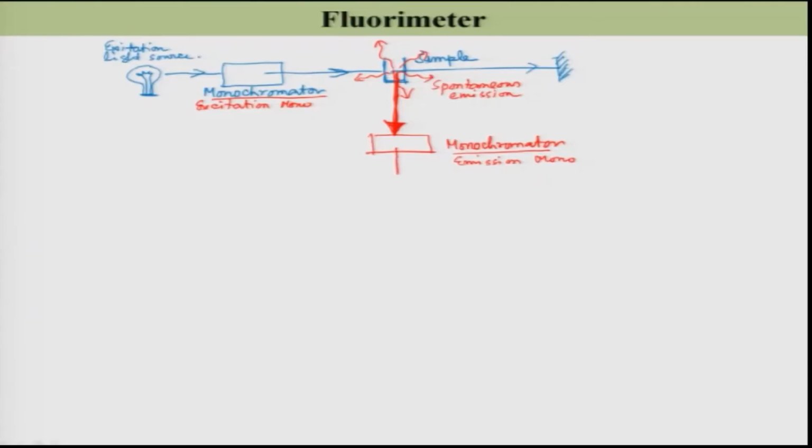So, now this is guided to the detector. I am going to have this detector over here, similar to the detector I discussed in the spectrophotometer.